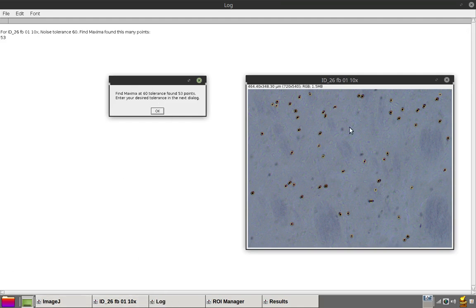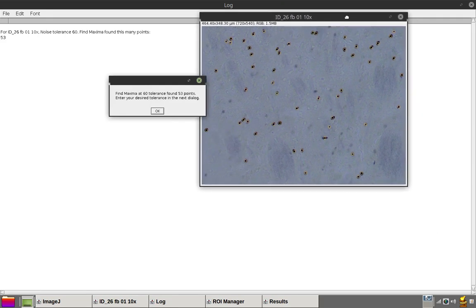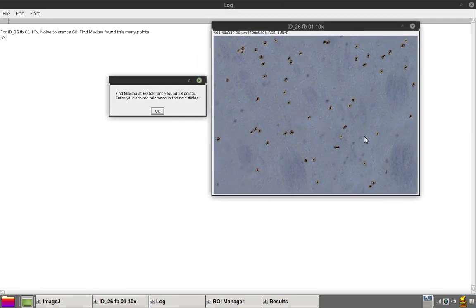At 60 tolerance or prominence, these are the points that have been selected.